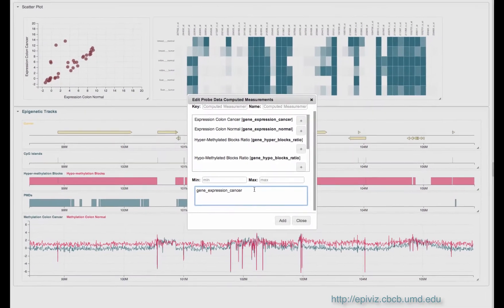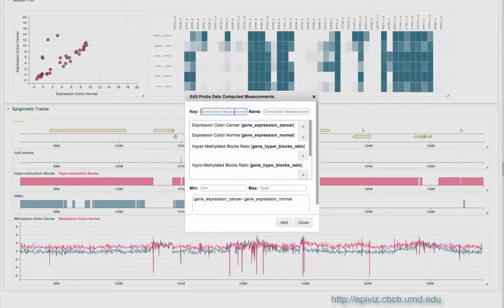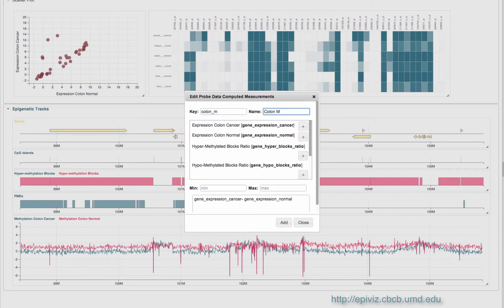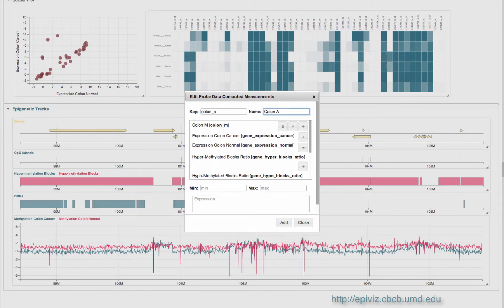That means we can define new measurements from existing data and display it alongside other data. For example, here we transform colon cancer expression data, so we can display the commonly used MA plot.